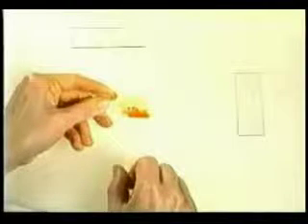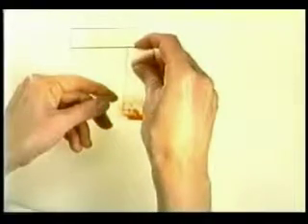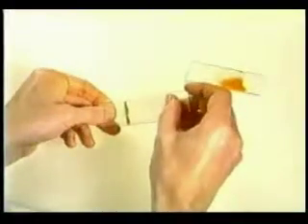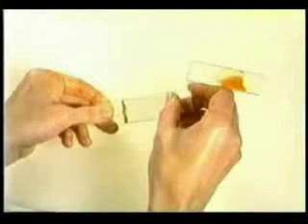Keeping the slide tilted, use the short edge of another slide to transport off a few fragments. Replace the bottom slide with a clean one and smear the harvest by putting the slides together at an angle like this.